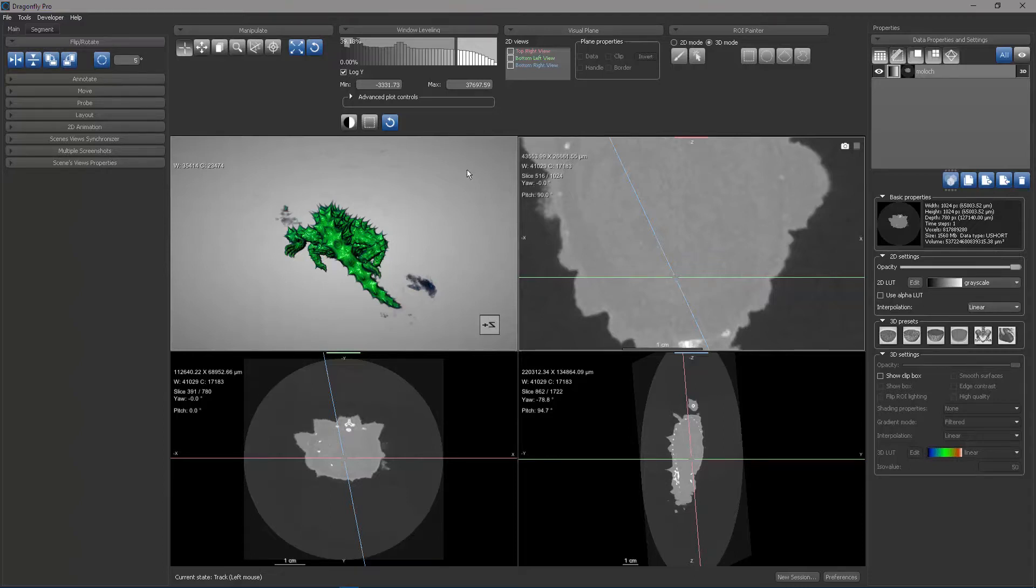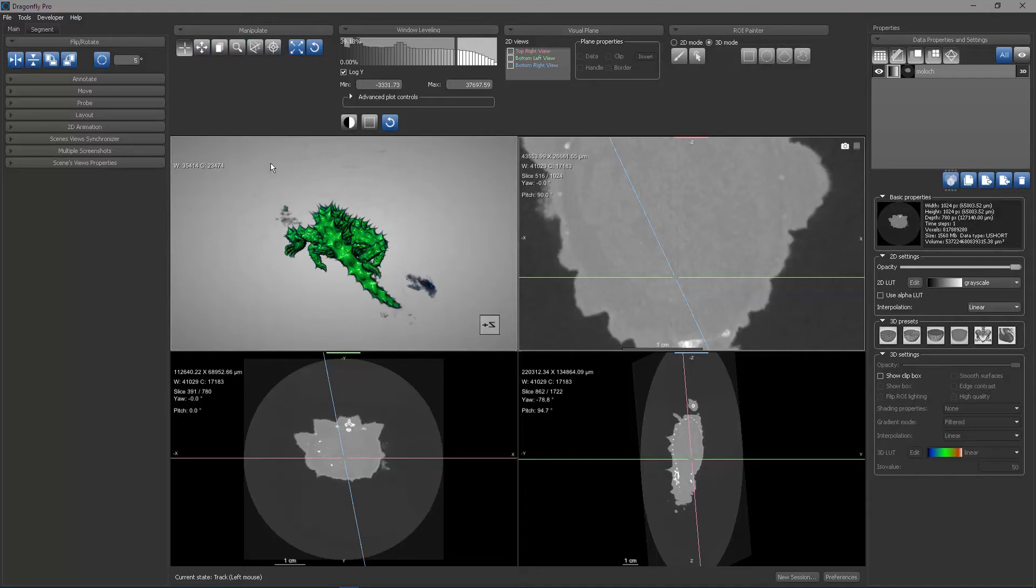We've seen the manipulate panel, which includes six different state buttons and two different action buttons for manipulating your 2D and 3D scenes. That concludes this demonstration.